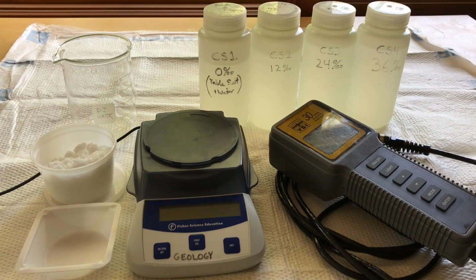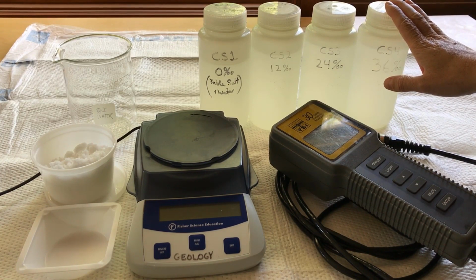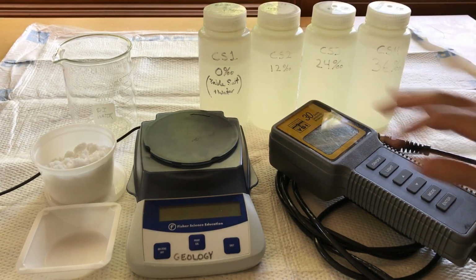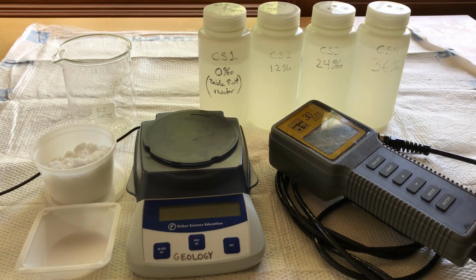To calibrate our meter, we're going to measure the conductivity of 4 solutions of known salinity. These are known as calibration standards. The measured conductivity of these calibration standards is then plotted versus their known salinity to produce a conductivity versus salinity calibration curve. We will use this curve later in Part B as well.